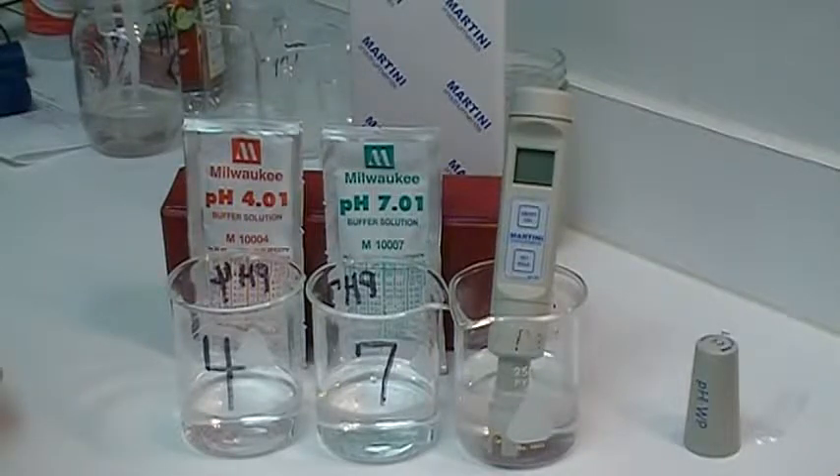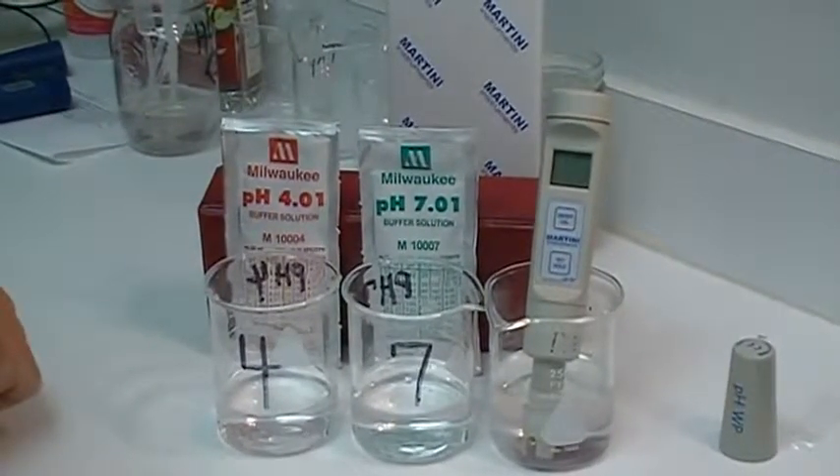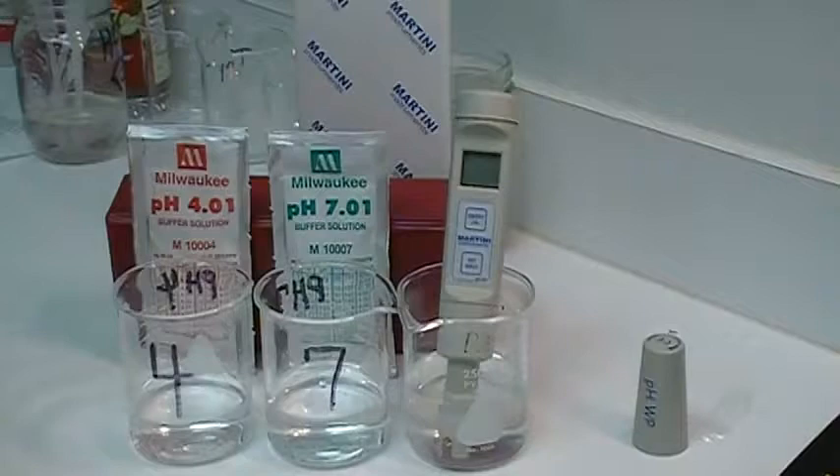This is a calibration procedure for the pH 55 and 56. It uses an automatic calibration procedure. As you can see, we start off with the unit — a pH 55 — sitting in the storage solution for the prescribed two hours, as indicated in your operator's manual.